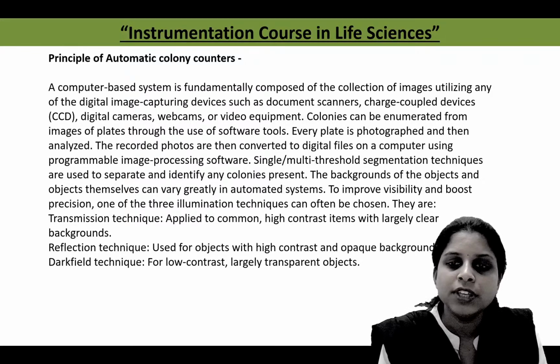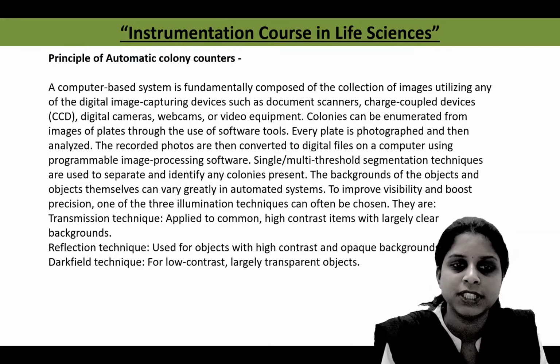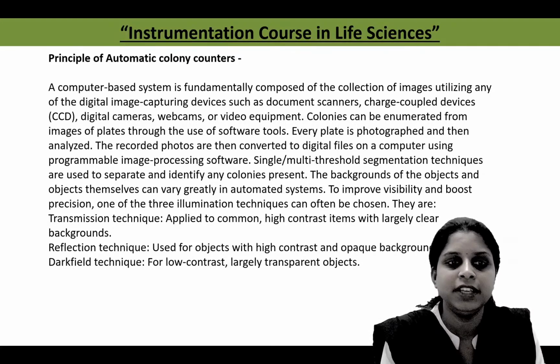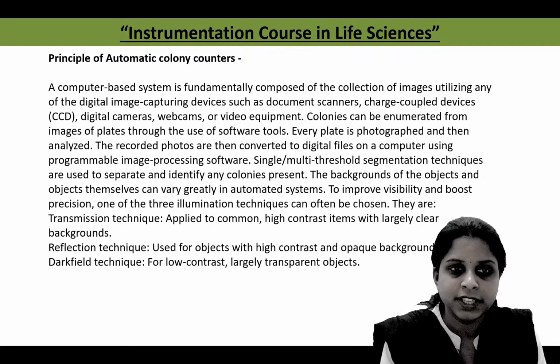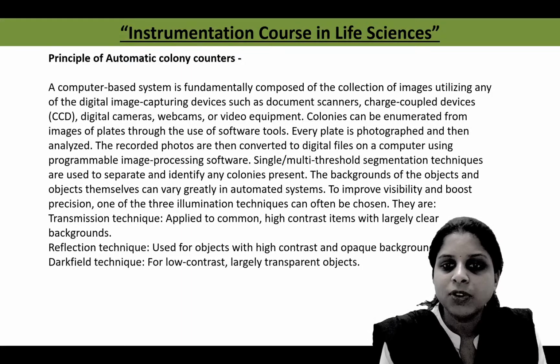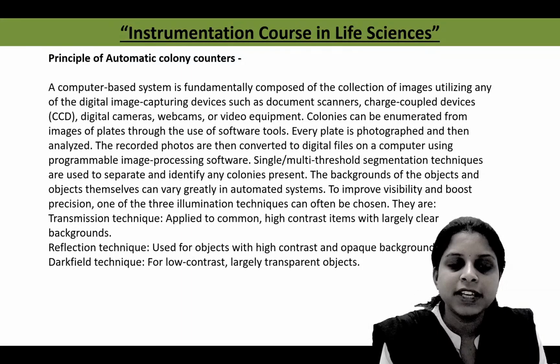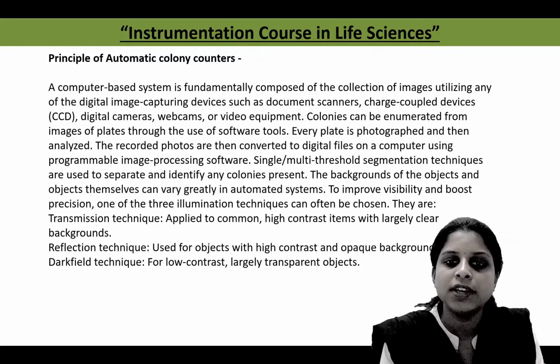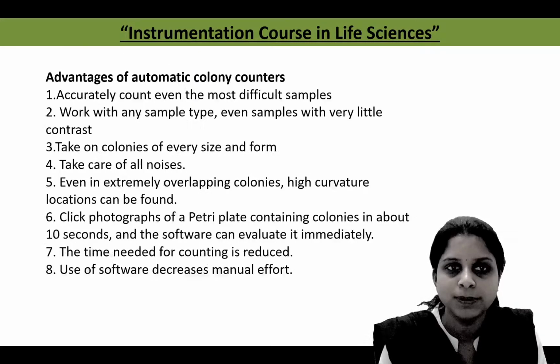Automated colony counters provide 3 different illumination techniques, meaning light sources. First one is the transmission technique, second one is the reflection technique and third one is the dark field technique. The transmission technique, which is commonly applied, is used for high contrast objects with largely clear backgrounds. Second, the reflection technique is used for objects with high contrast and opaque backgrounds. And third, the dark field technique is for low contrast and largely transparent objects.